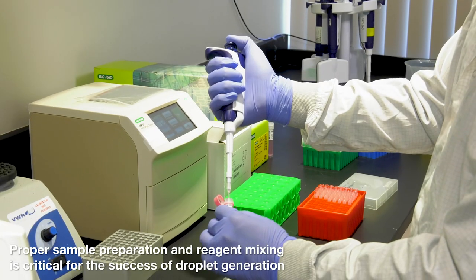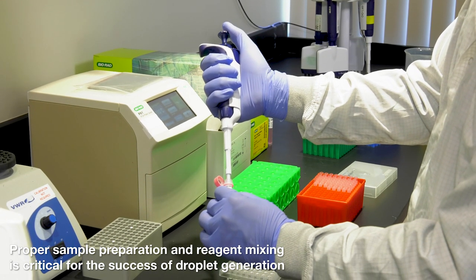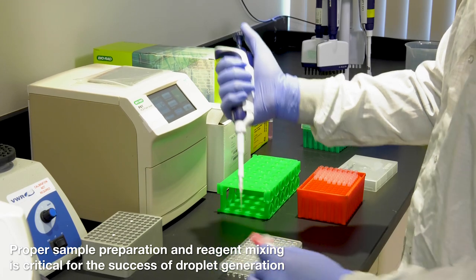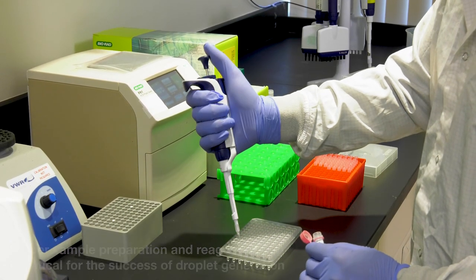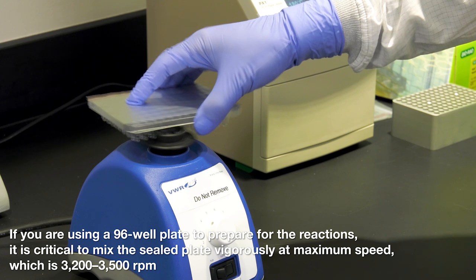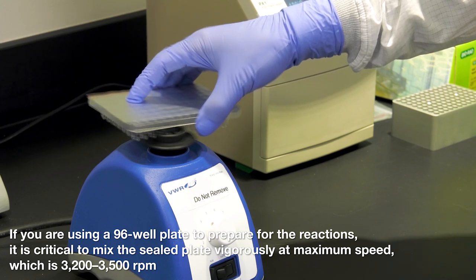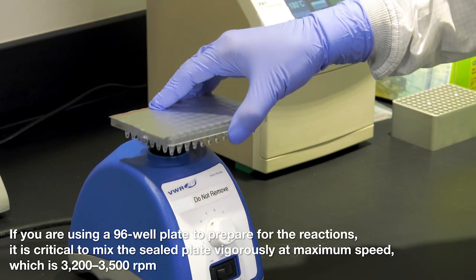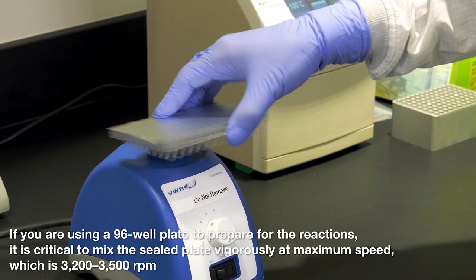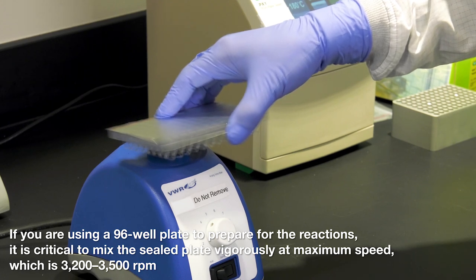In conclusion, proper sample preparation and reagent mixing is critical for the success of droplet generation. If you are using a 96 well plate to prepare for the reactions, it's critical to mix the sealed plate vigorously at maximum speed, which is 3200 to 3500 RPM.